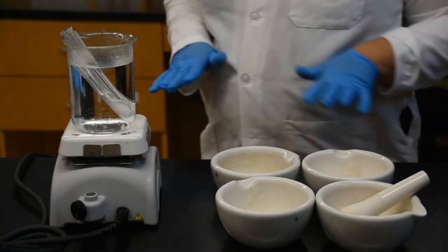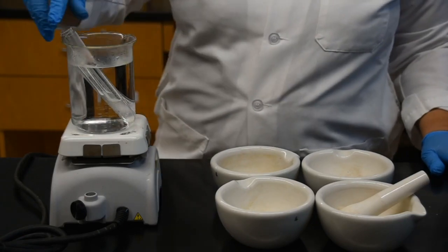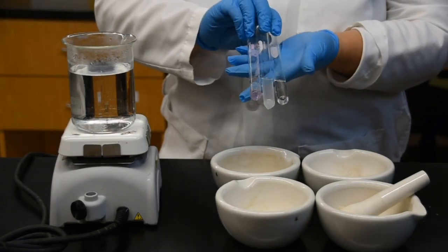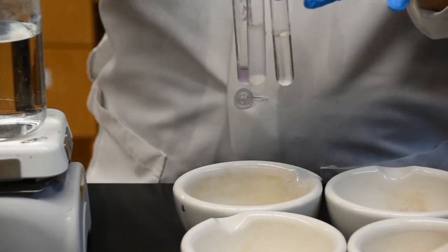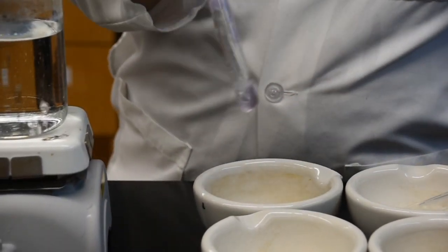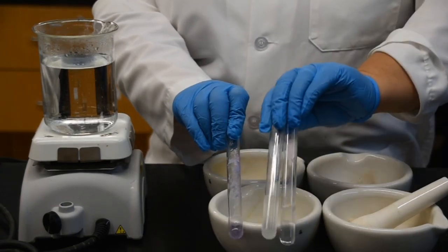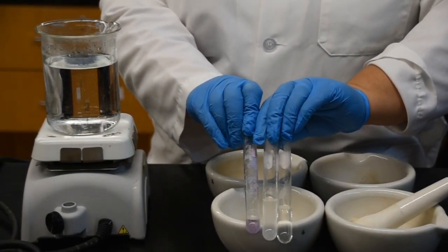Now I'm going to shift because I want to finish up the setup for you guys here. So right here we have our sample again. I don't know how clearly you will see this, but notice the first 2 tubes have no color change, so they're staying the original color, but the last one has a purple tinge to it. This purple tinge basically identifies that your sample has proteins in it, versus when you compare it to the other 2 samples, the samples are clear, which means no protein was present in it.